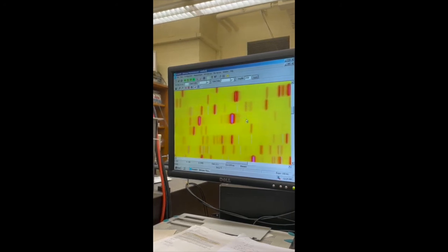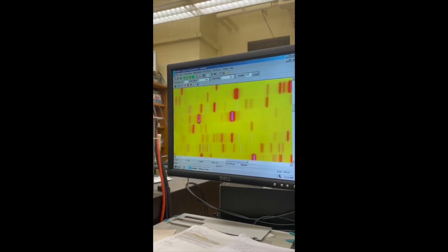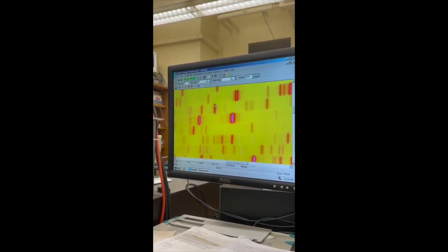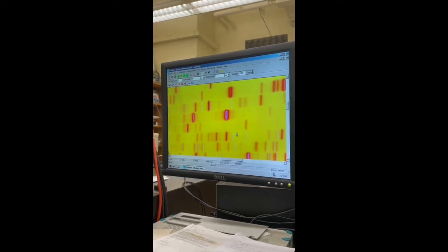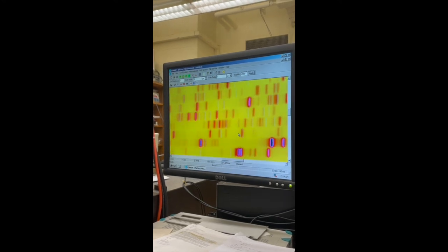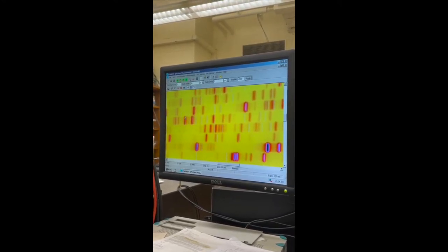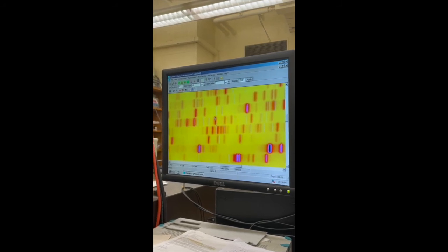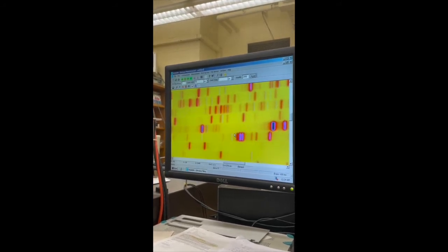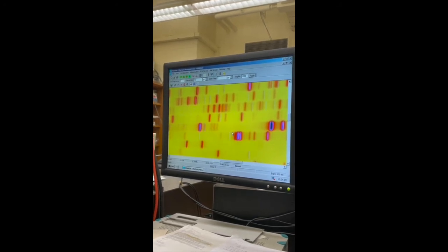So that looks pretty good. Those ones on the left, there's one that looks centered. You're looking for, do you think that vertical line is centered in the colored region or not? Some of these look like they're right in the middle. So that actually looks pretty good. So I would say, yes, this is properly calibrated. It's going to be important because you want the wavelength of the light you measure to be correct.